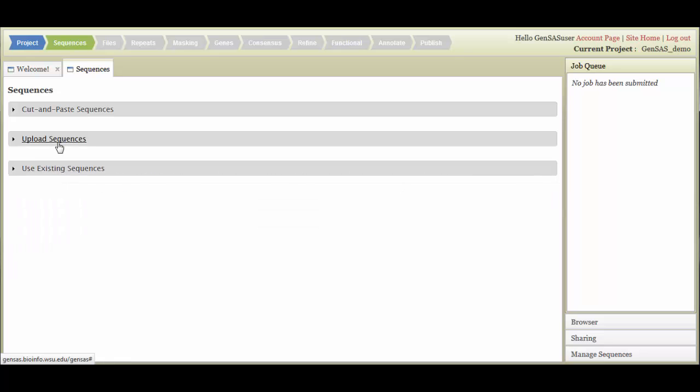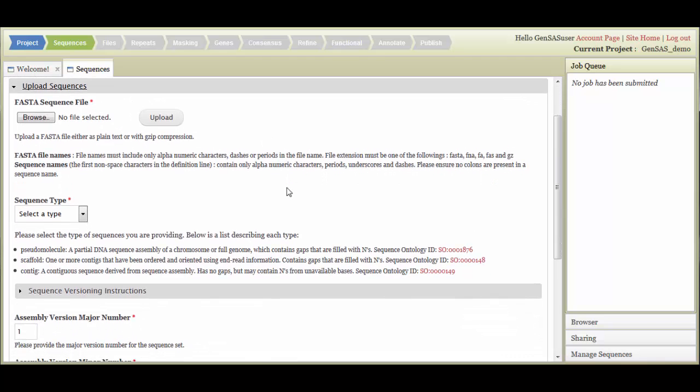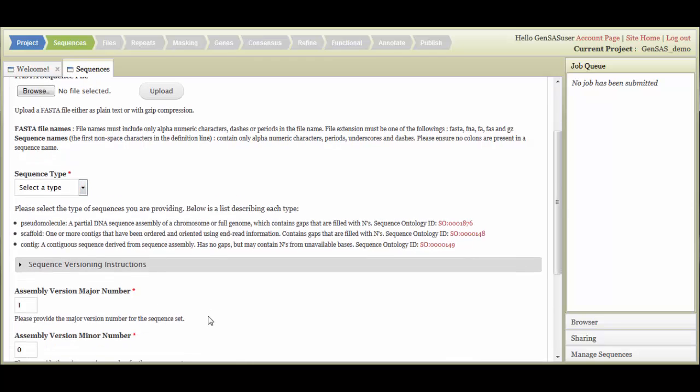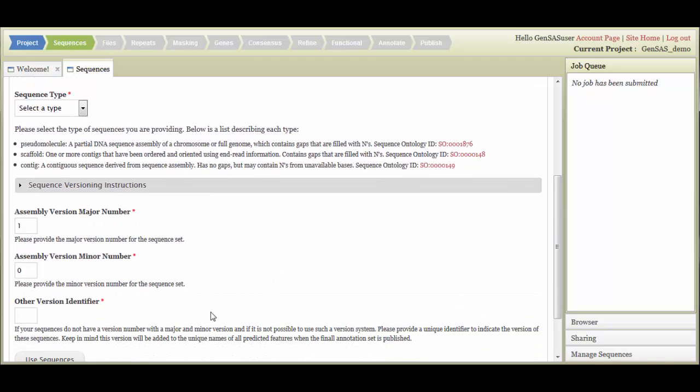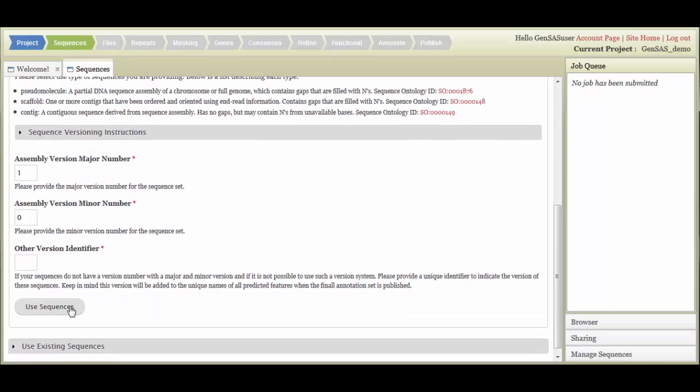You can also select sequences that have been previously uploaded into GenSaaS. For new sequences, you can upload FASTA files with multiple sequences, but please note that all sequences in that FASTA file will be analyzed in the project. Please follow the instructions about what characters can be in the FASTA file name. Then, please select the sequence type and enter the assembly version number.